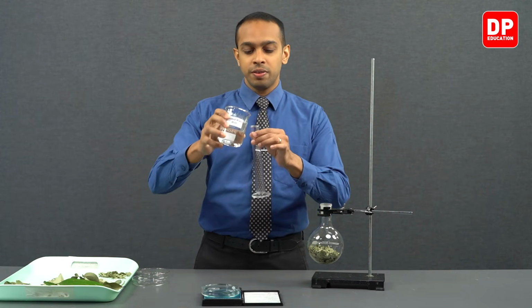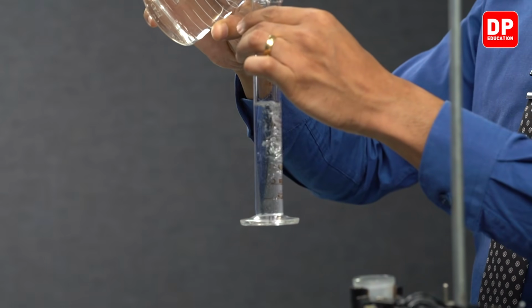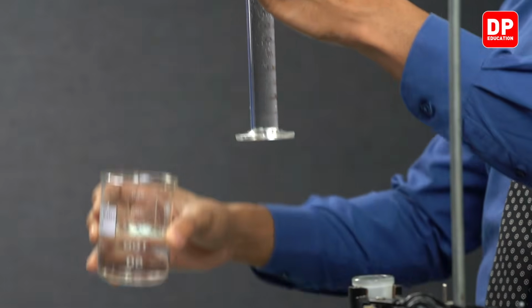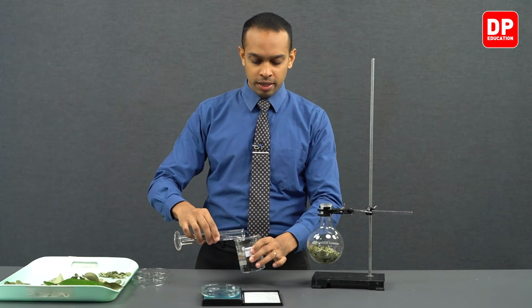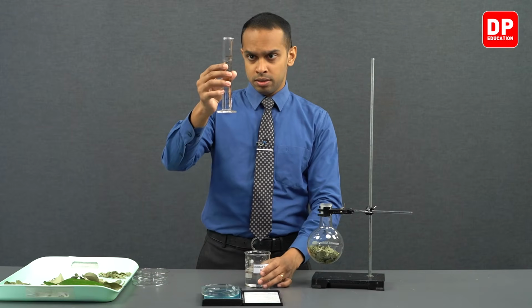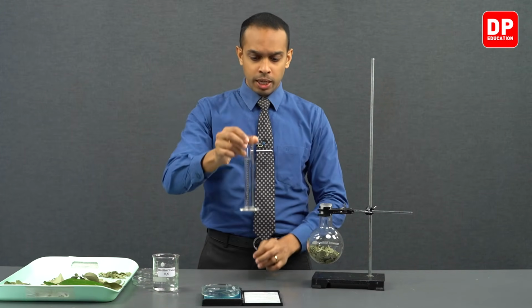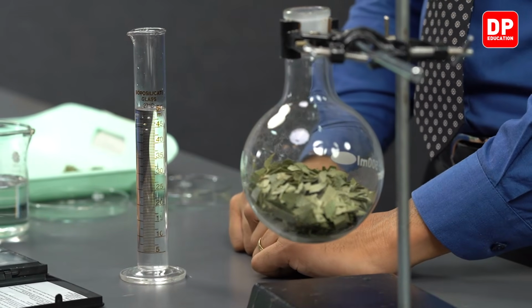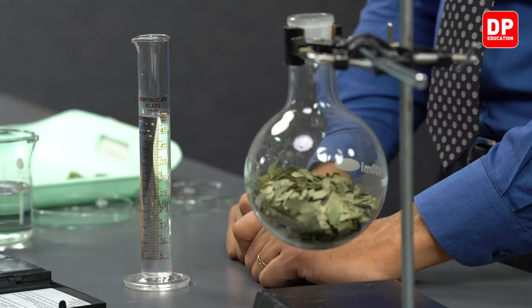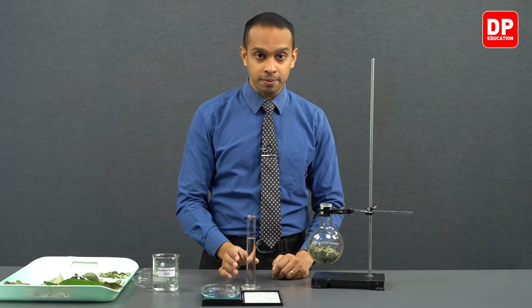So now we'll be transferring 50 milliliters of distilled water into this round bottom flask. As you can see here, we have measured 50 milliliters of water, and we are going to be adding 50 milliliters of water into our round bottom flask here.